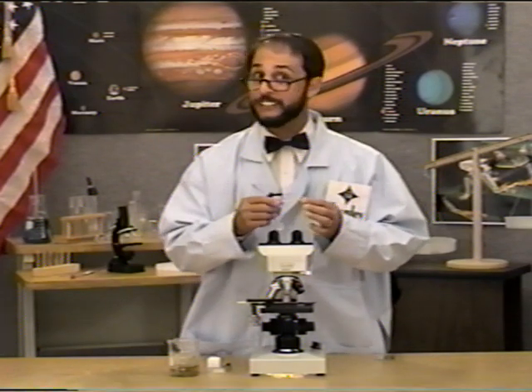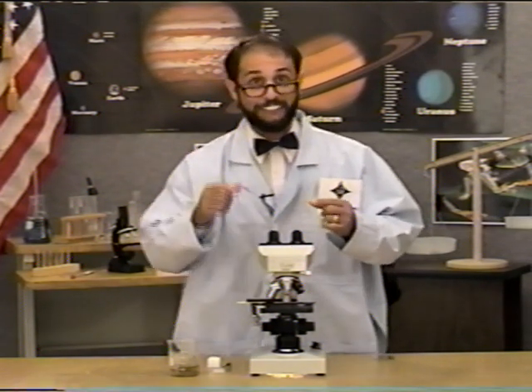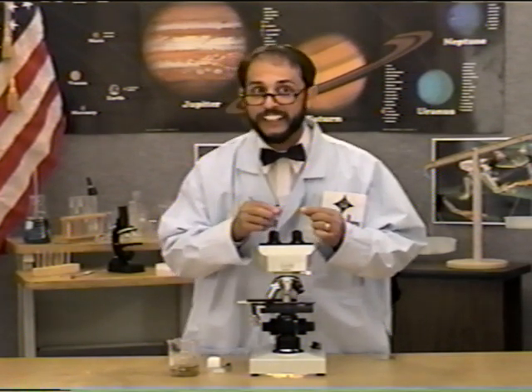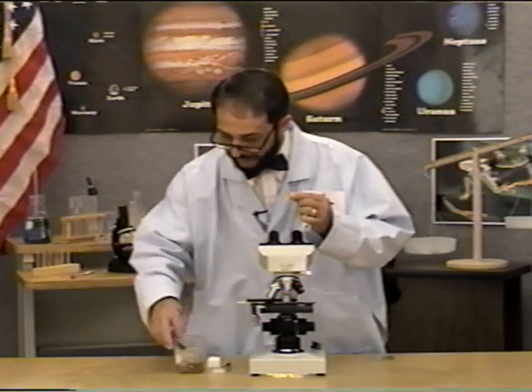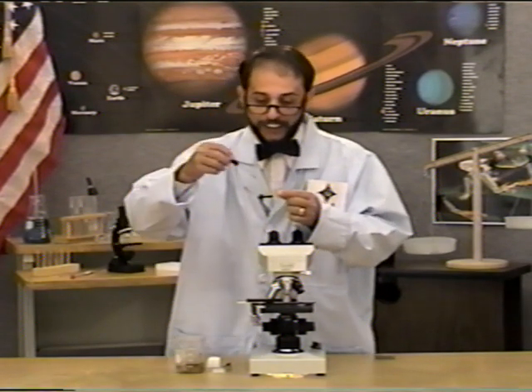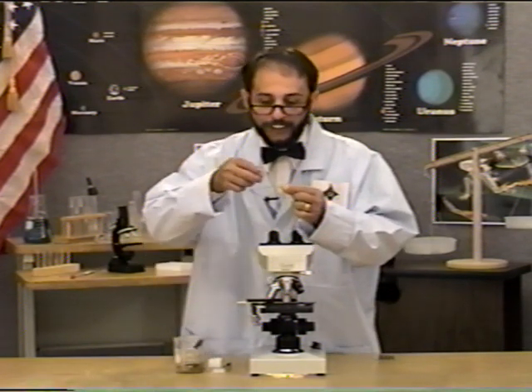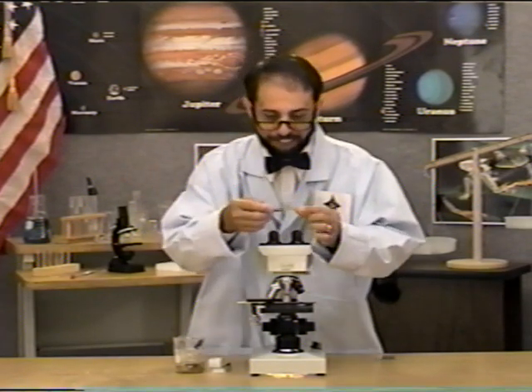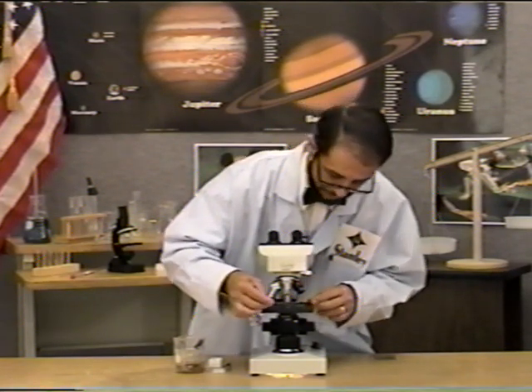Next, we're going to observe some very tiny organisms that can't get away and are very easy for you to observe. That's because they'll be trapped in your little puddle. I'm referring, of course, to the microorganisms in pond water. I have some pond water here, which I'll carefully put a drop of onto my slide in hopes that there'll be something in there. Next, we'll put a cover on it, being careful not to press it so we don't squish things or push too much water out around the edges, and we'll insert it into our microscope and take a look.